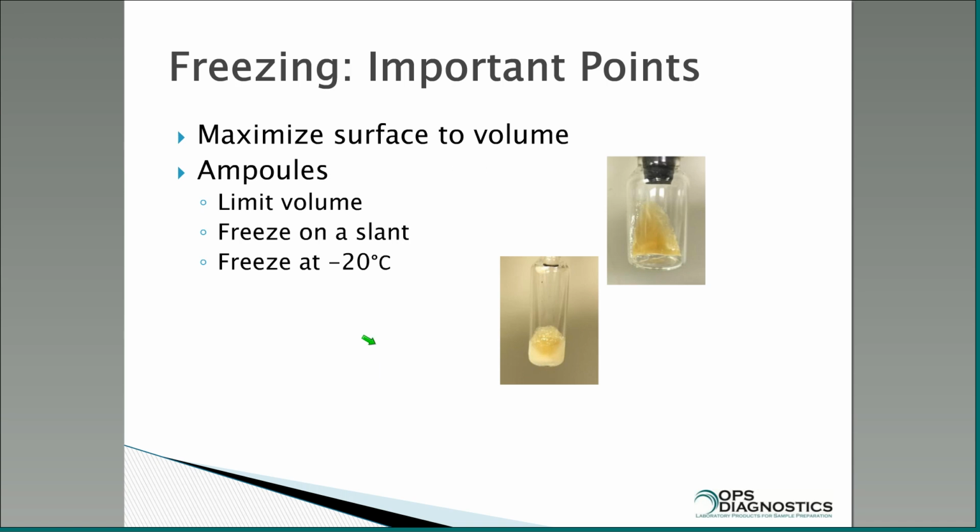So in ampules, and these are both hooked up on ports, by the way, when you're doing freeze drying with a port, you want to really keep your volume small. You want to freeze on a slant, and ideally freeze at minus 20, so that it's nice and easy for the water to get out of the sample.